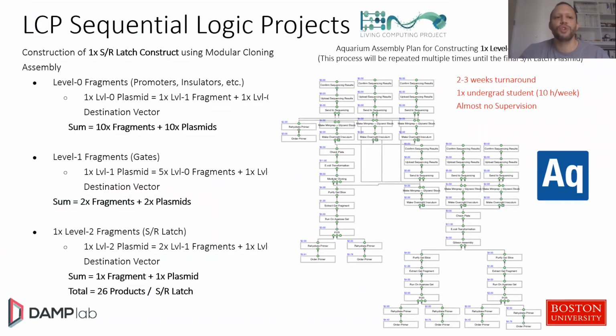We do things like what's shown on this slide, which are creating genetic circuits. This is just an example. The graph on the right is showing all the different steps that would need to go into making these circuits, just to give you some sense of the scale. But also you can start to find parallelism in this graph. How many people would need to be used, liquid handling robotics, what can be done in parallel, what needs to be sequential. We can think about scheduling this.